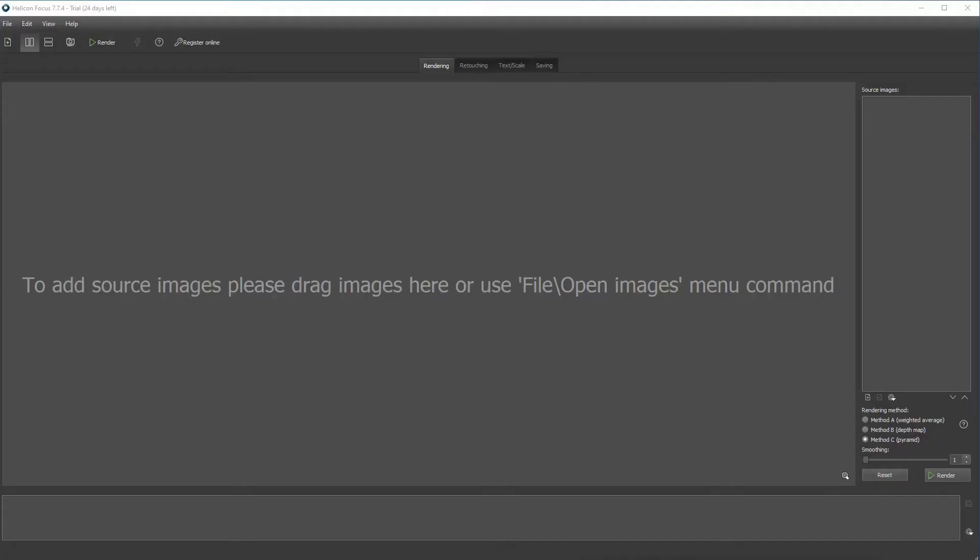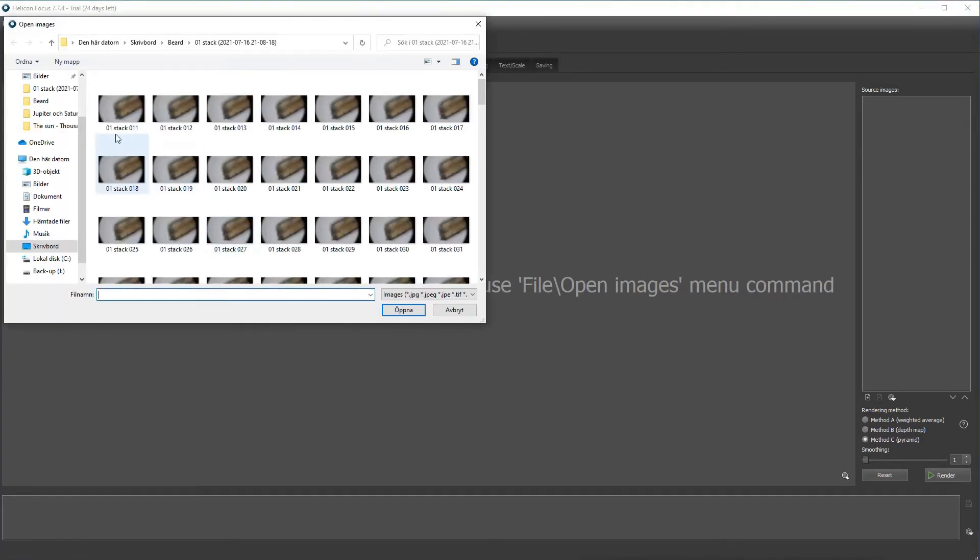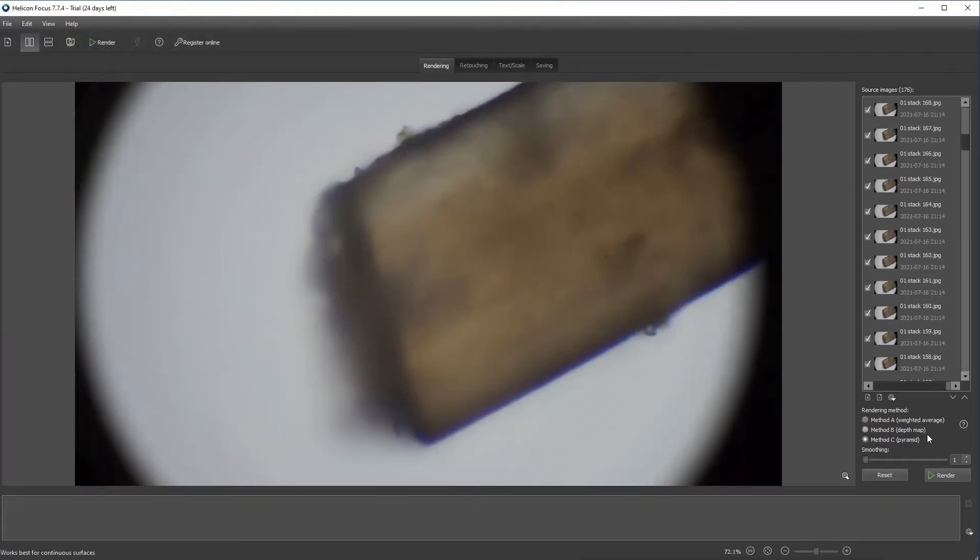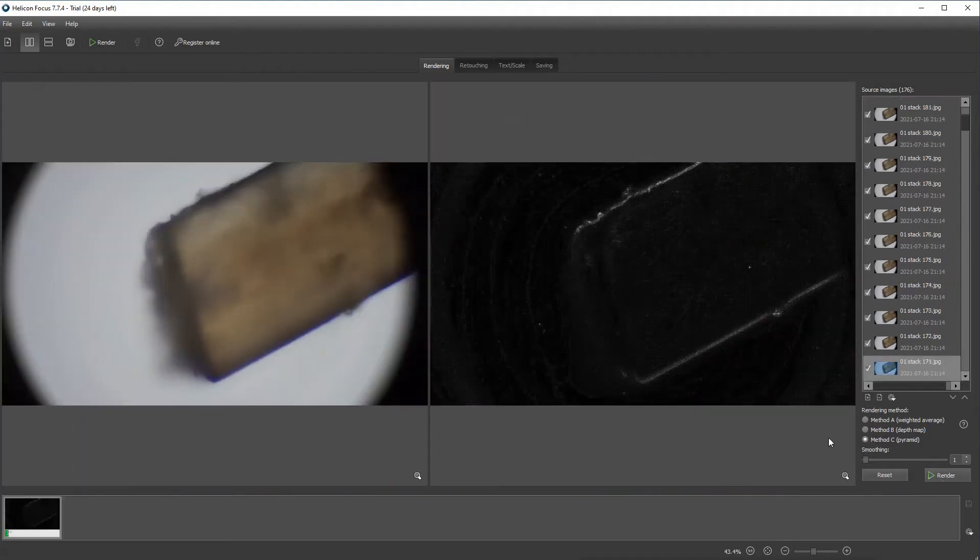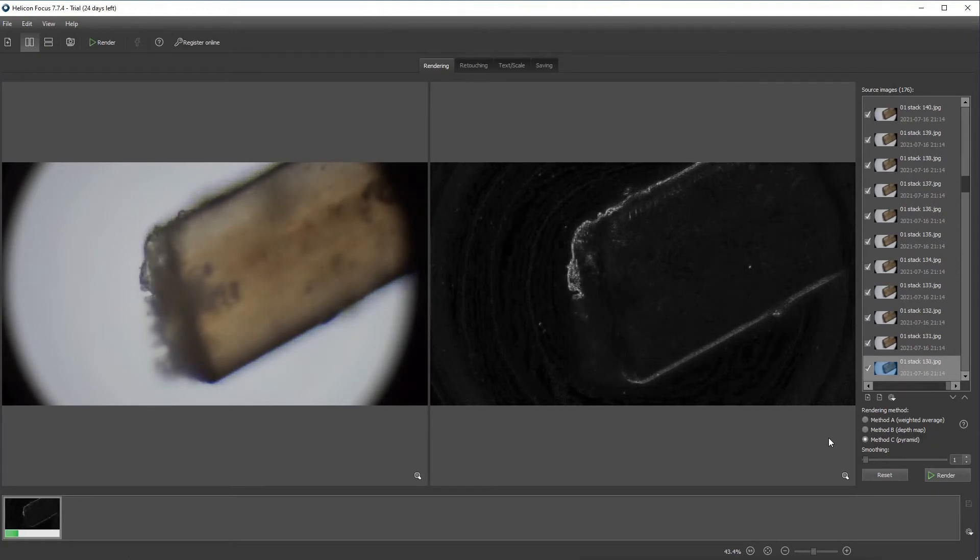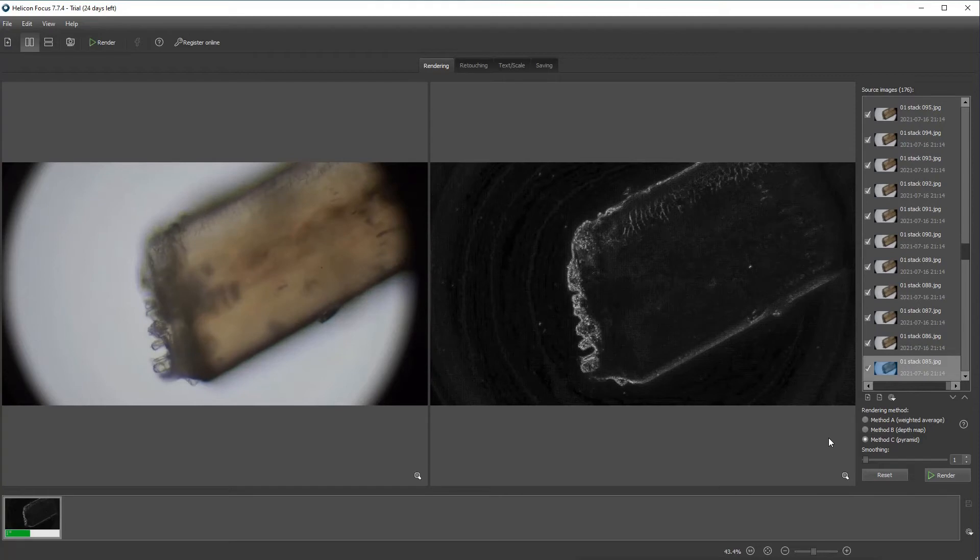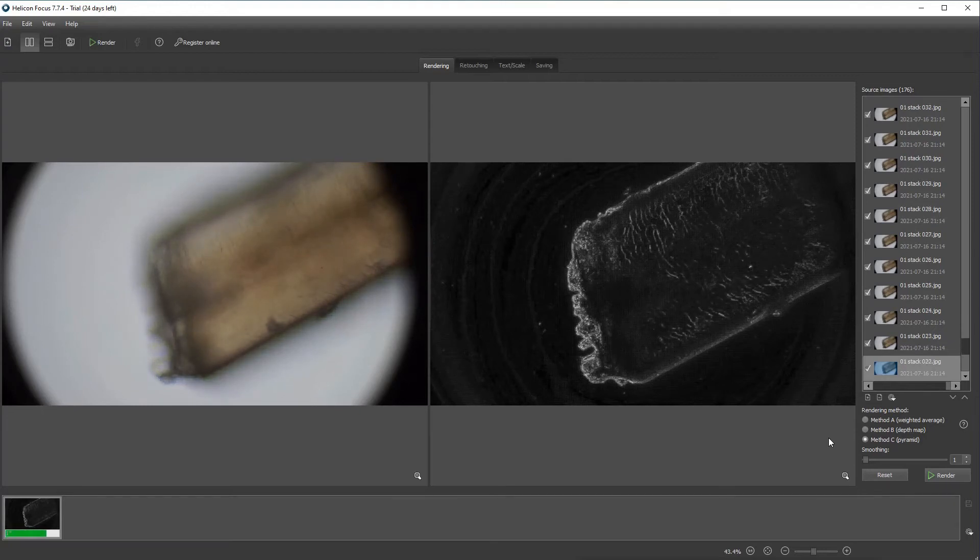And next step is to use the Helicon Focus 7 to stack the images. So I start opening all the pictures that I extracted from the video. I choose this setting, pyramid something, because it explains that it's for deep stacking and I think I have quite a lot of images. So I hope this one is the best one. If you have some tips just comment. Here we can see the program working. It looks up the sharpest point in all the images and combines them to one sharp image in the end hopefully.